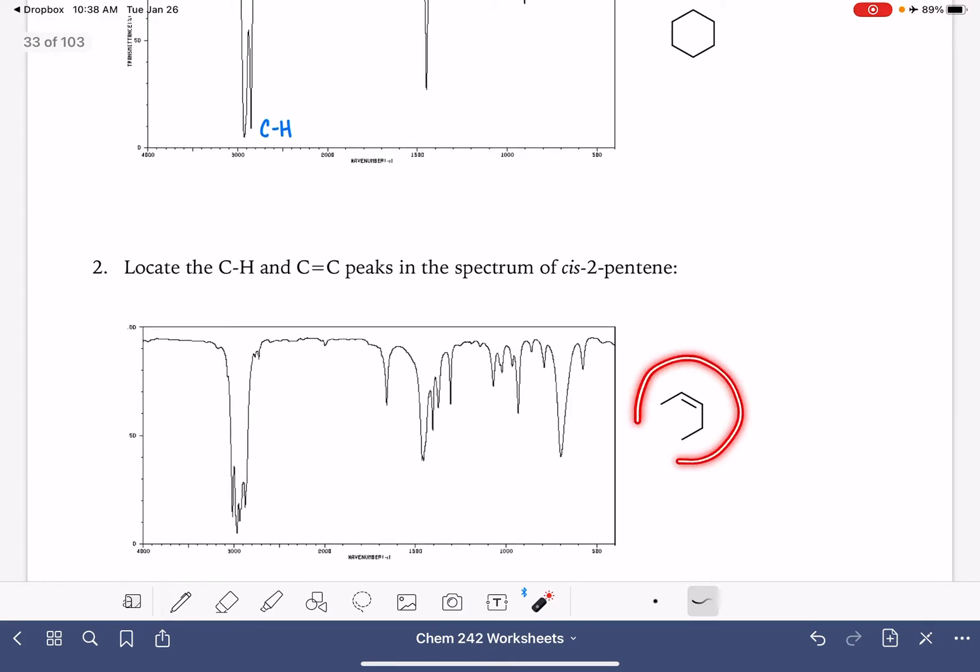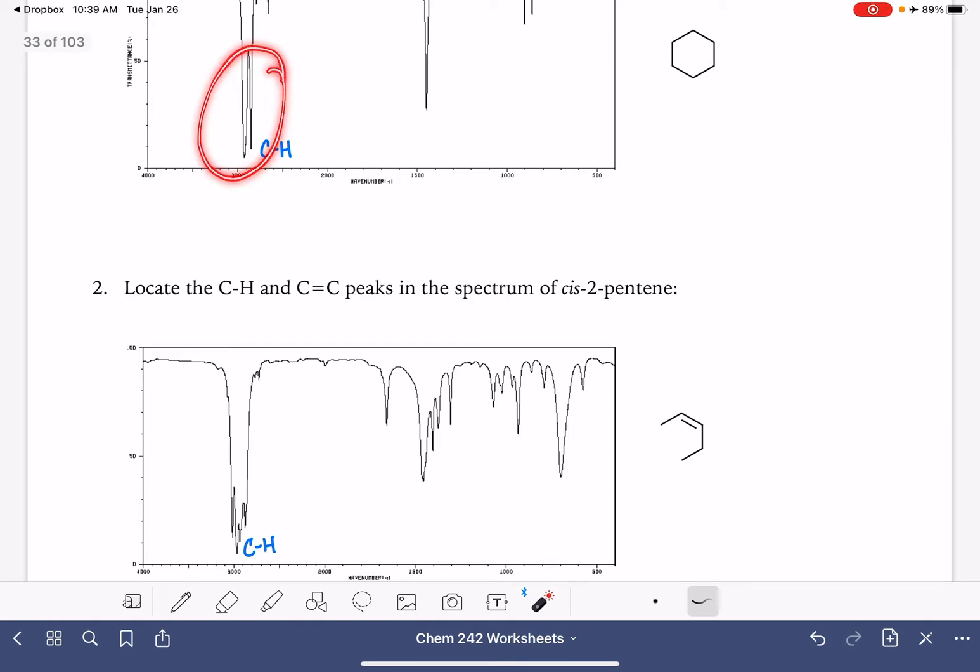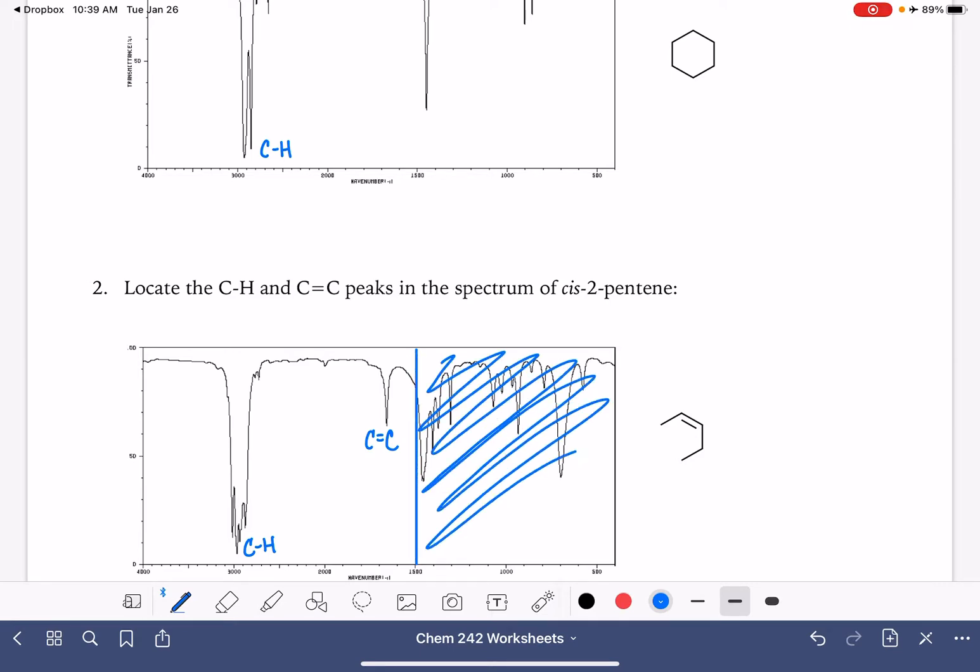Here is cis-2-pentene. This molecule is a little bit more interesting because it has a functional group. So let's find the carbon hydrogen peaks and the carbon carbon double bond peaks. Carbon hydrogen peaks are always hanging out here around 3000. They don't always look exactly the same from one molecule to another. Their shape will vary, but they're always going to be in the same spot. And what about the carbon carbon peak? Remember, our double bonds are somewhere in the 1500 to 3000 area. So this right here is going to be our carbon carbon double bond right there. How do I know that it's this one and not this one specifically? Well, in the previous video, I showed you to just kind of draw a line at 1500 wave numbers and ignore everything to the right of that line. So I'm ignoring these peaks right here.